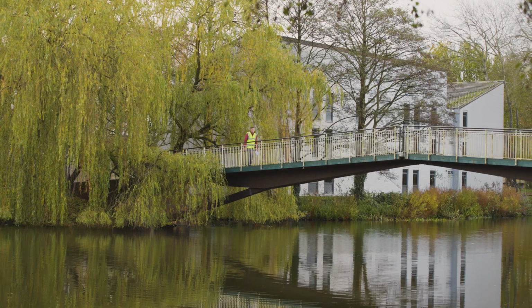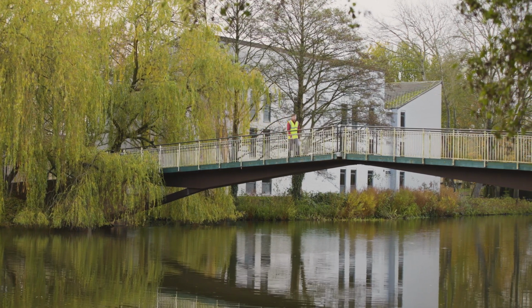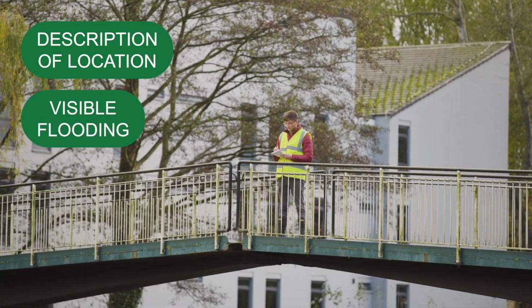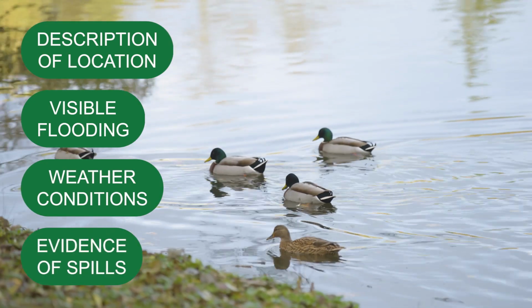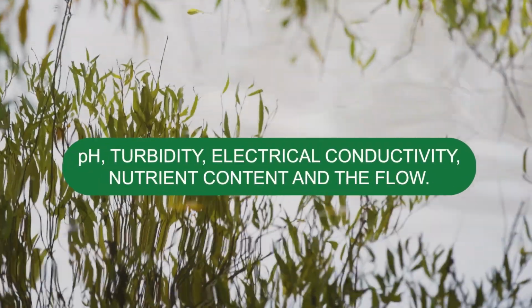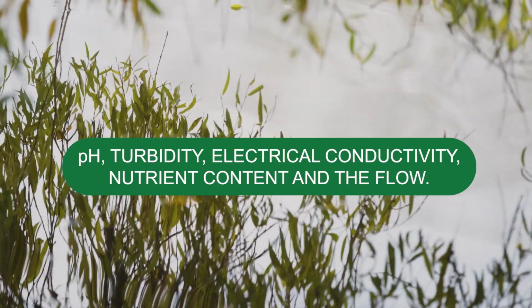Once you've arrived on site, there are initial observations you may want to record. These could include a description of the location, whether there's any visible flooding, weather conditions and temperature, any evidence of spills. It may be beneficial to measure additional water properties including pH, turbidity, electrical conductivity, nutrient content and the flow.